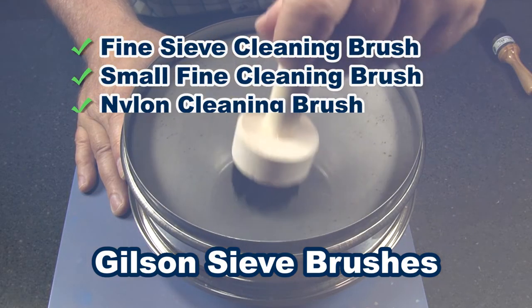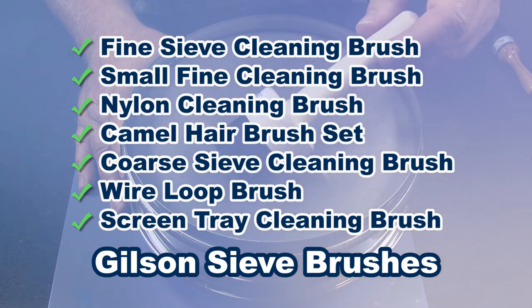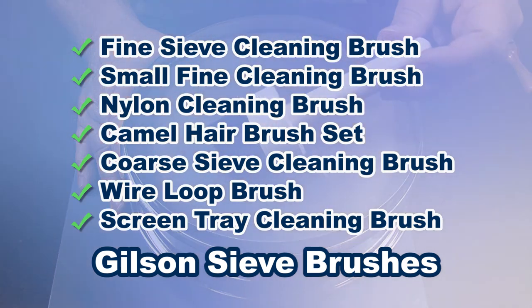Gilson offers sieve brushes in several styles and bristle types, and are designed for safe and thorough cleaning of test sieves.